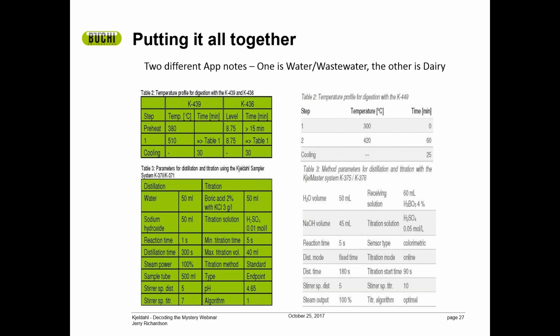And then when we're ready to titrate, what we're going to do is increase that rate so that we can have better mixing to get us to a finer end point. Okay, hopefully that makes sense, very straightforward in that regard, but that's the reason for the 2 stir speeds.